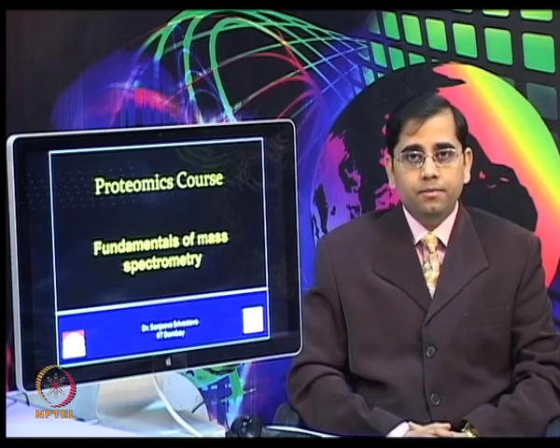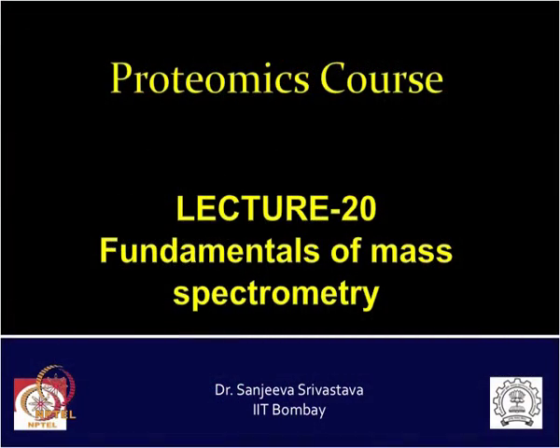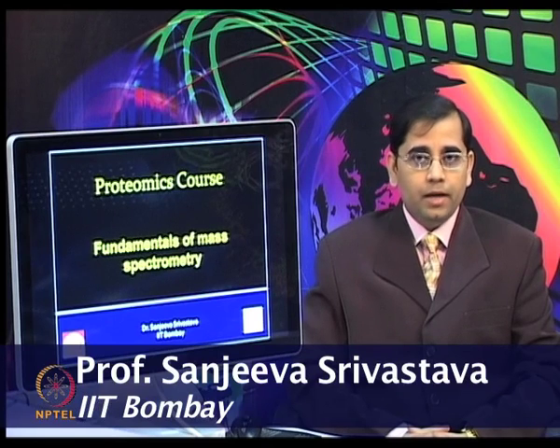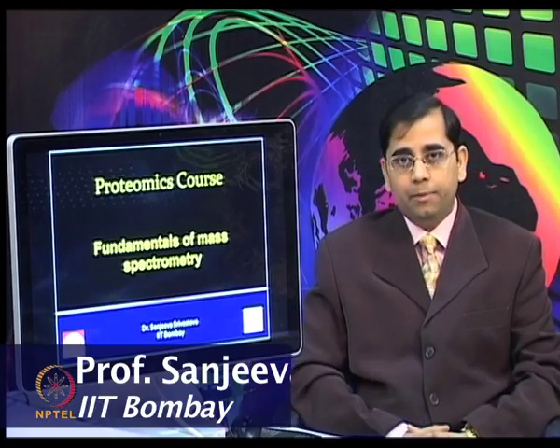In today's lecture, we will talk about fundamentals of mass spectrometry. So, let us switch gears from the previous module on gel based proteomics and now switch on to mass spectrometry and its various types of applications.